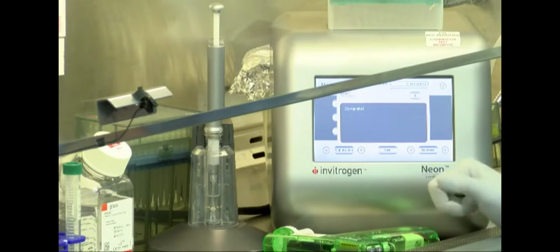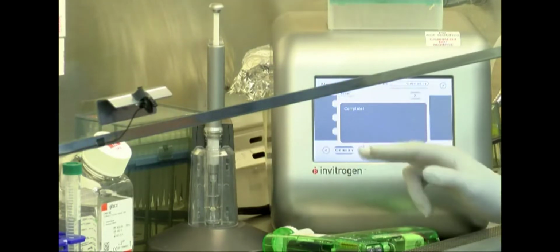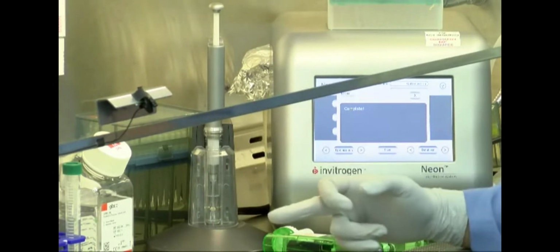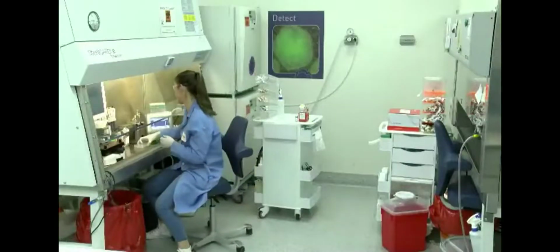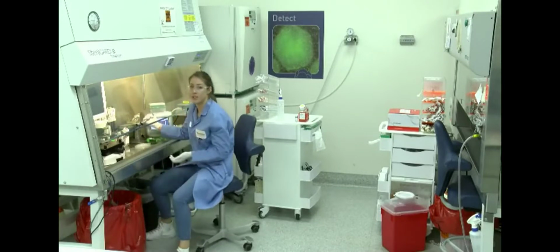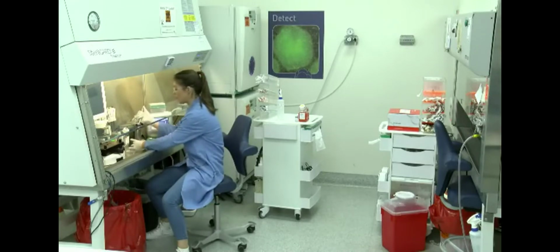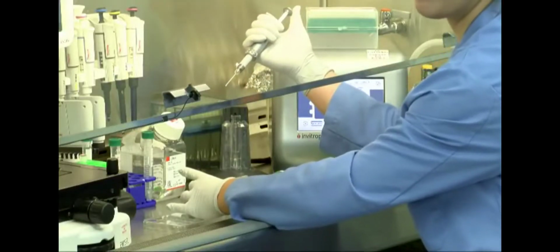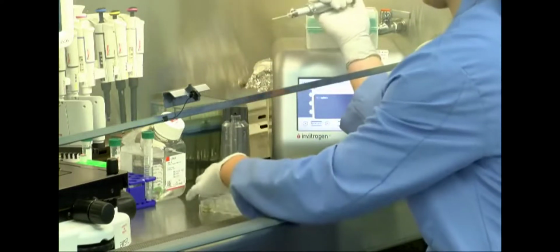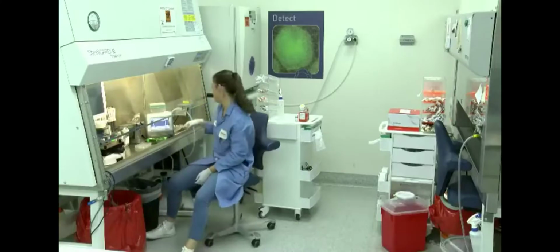Nice, okay, it worked. So once your electroporation is successful, complete will appear on the display. And at this point, you can deposit your cells into the well that we prepared earlier. So that error was likely due to the tip not being properly attached to the pipette. And then you can just use the pipette as you would a normal micropipette and deposit your cells directly into the well. Then you can eject the tip by pressing all the way down on the plunger.